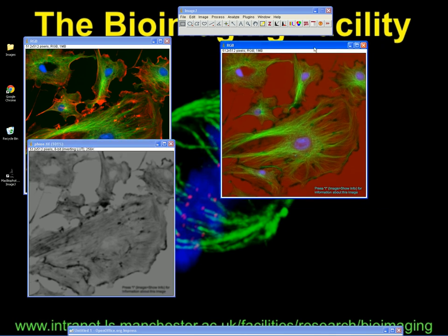Another way that people commonly do it, if they've only got two fluorescence channels, is to put the third channel as the grayscale image. So in this case you have the DAPI, the green FITC channel, and then the red channel is actually the bright field image. So your image would look kind of weird when you open it in ImageJ — it has this really strange coloured background.